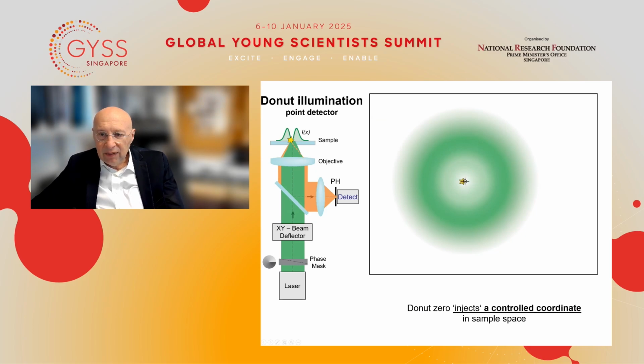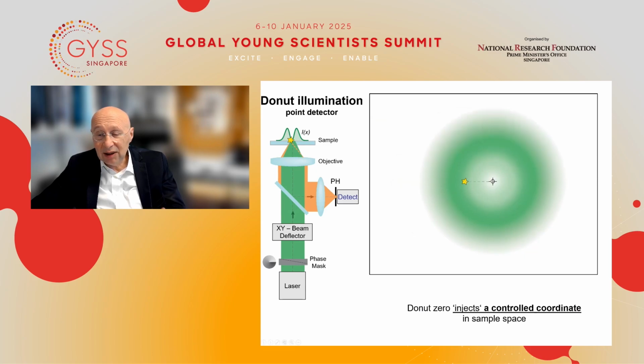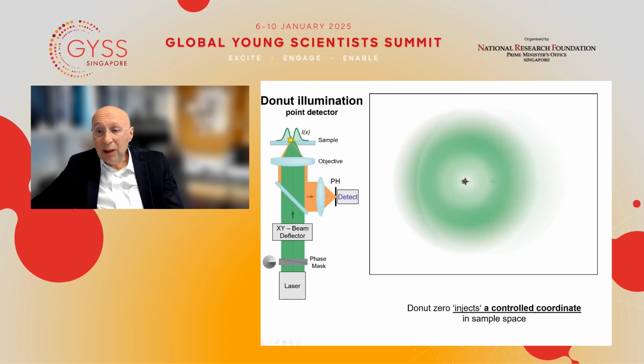And as I said, if the molecule is slightly off, there will be some excitation going on and some emission going on, and hence some measurement, of course, of fluorescent photons, but only weak. But if it's, of course, very far away like this, then it will be strong. So in other words, the brightness tells us how good the match between the two is. And once the match is done, we know where the molecule is.